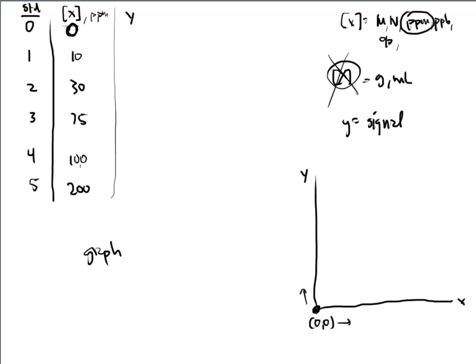I've made these standards, I've followed my recipes, I've done the proper calculations that I should have, and those are the concentrations that I have ended up making. And these standards are eventually going to be run on a piece of equipment. Whatever piece of equipment it is, that's going to change and it's going to vary. But I'm going to run these things that I have made on a piece of equipment.